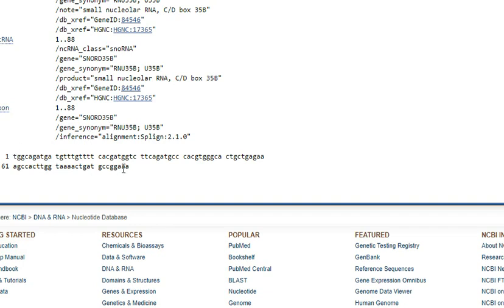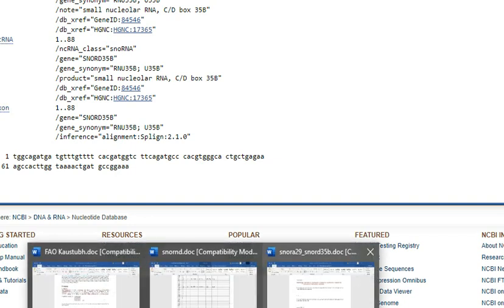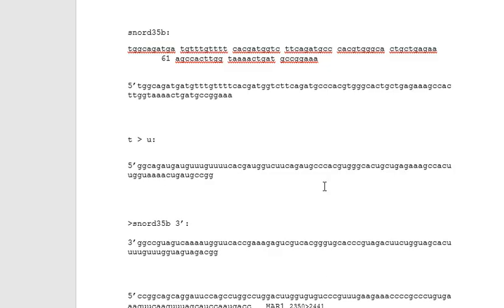There it is. So if I copy and paste this, there it is. I just tidy that up, then convert thiamine to uridine. Still 5' to 3' direction.